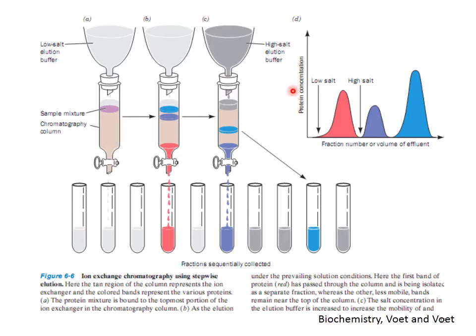This is a graphical representation. It shows protein concentration on the y-axis and the fractions of the protein on the x-axis.